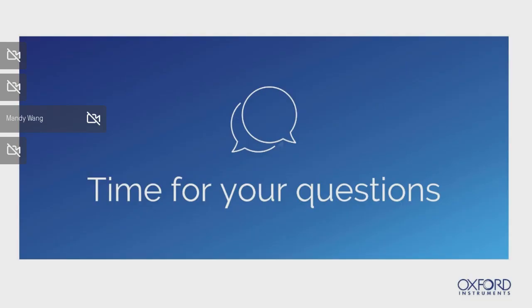Yes, I will answer about this. In the case of the HG lamp, usually it will be the argon HG lamp. It can be located outside or inside, both can be chosen.